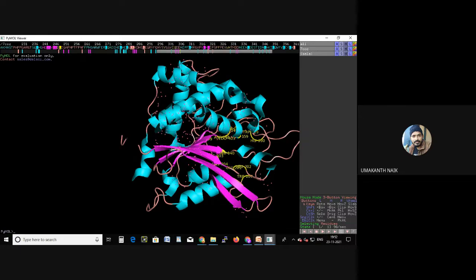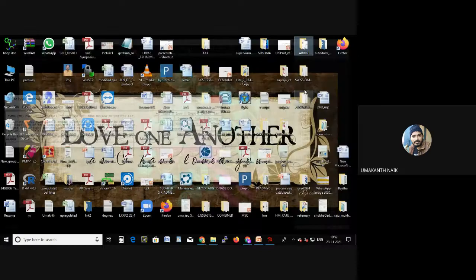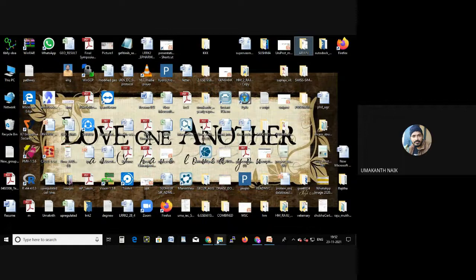So I have given some dialogue. That is called select residue. Select a residue. If I want to see valine, go for select valine. That is the 3-digit code of whatever you want. If you want to see glycine, give glycine. It will select everything. No need to go and find everything. After I'm selecting, oh, I'm sorry, it has been closed. Once again, I'll open.